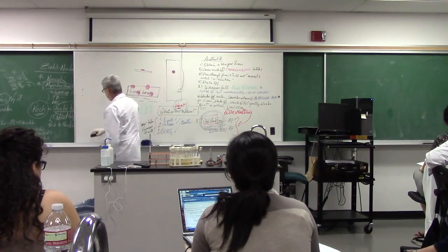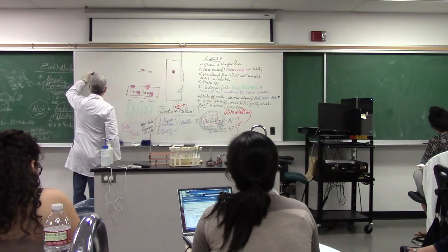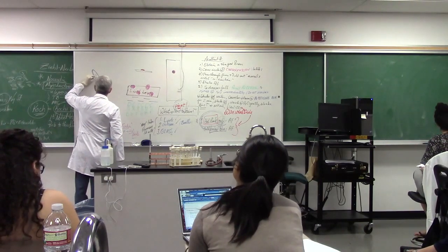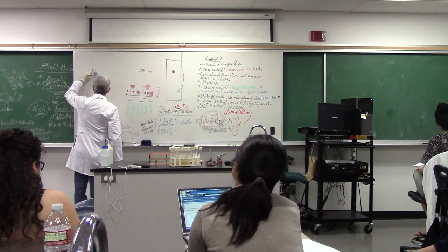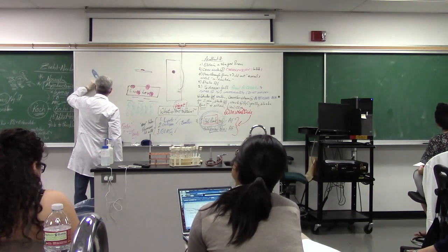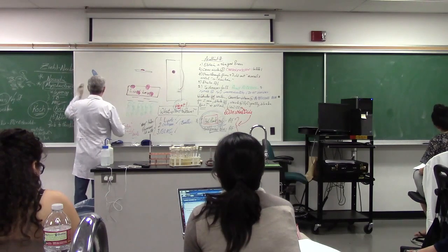Some Bacillus will give you this appearance. Remember, the vegetative cell is going to take the baby blue. And when I ask you, what does the cell stain? If the cell is blue, you're going to say acid-fast negative. Even if you get this.